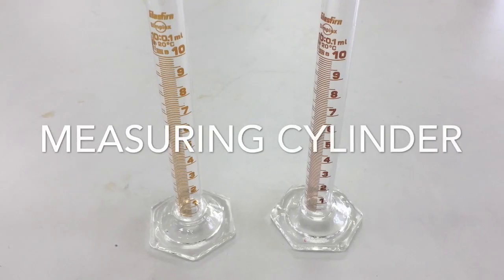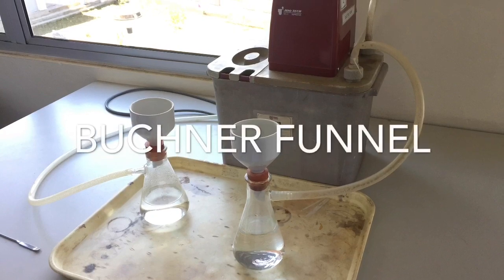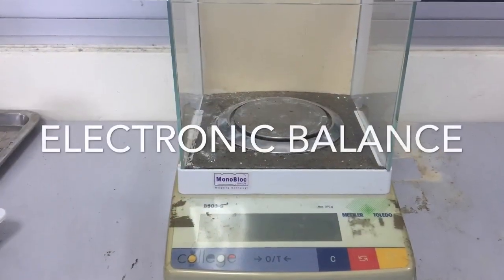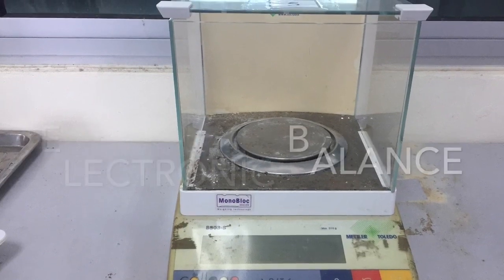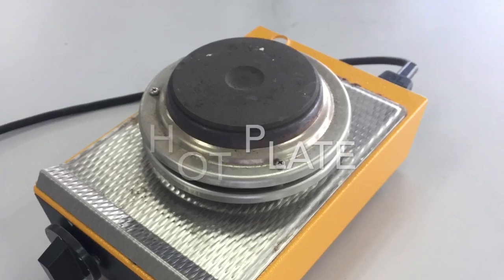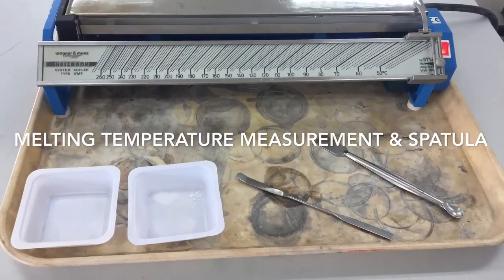measuring cylinder, Buchner funnel, electronic balance, hot plate, melting temperature measurement and spatula.